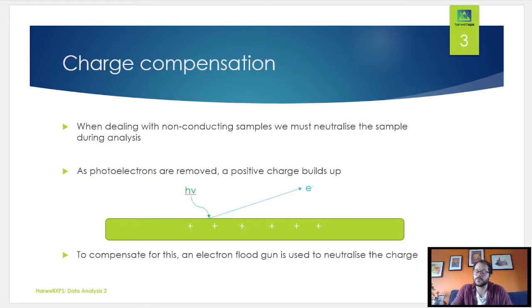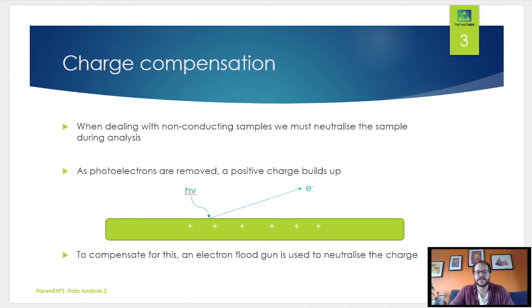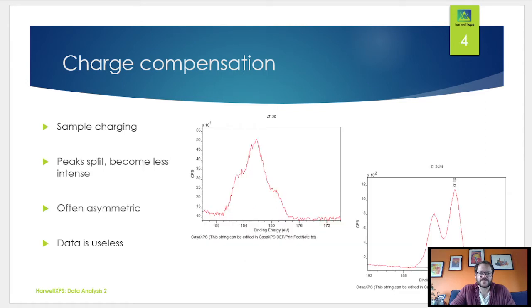So first things first - why do we need to calibrate our data? This is not really an issue when looking at conductive samples, but a lot of the time in XPS we look at insulators or semiconductors. For these, there's going to be some charge buildup. As we remove electrons from the sample, we get positive charges building up on the surface, and further photo-ionization is going to be affected by this broad positive charge buildup.